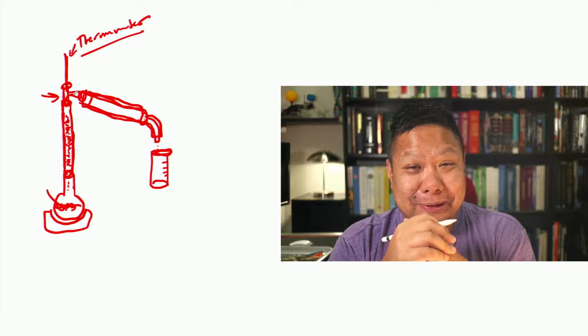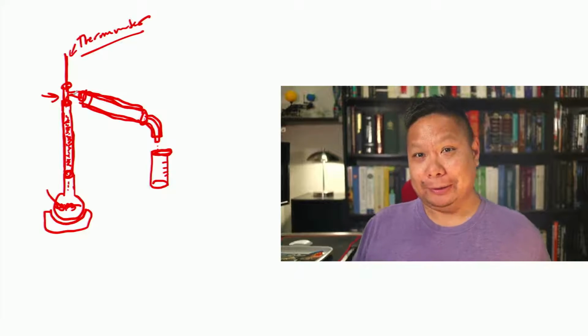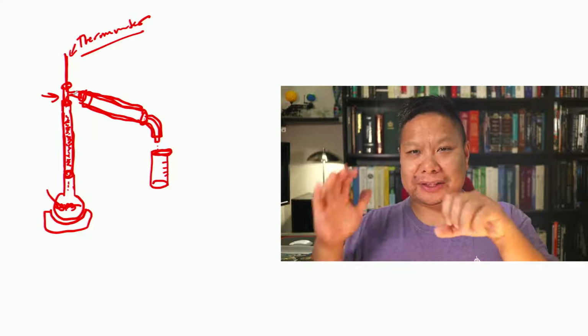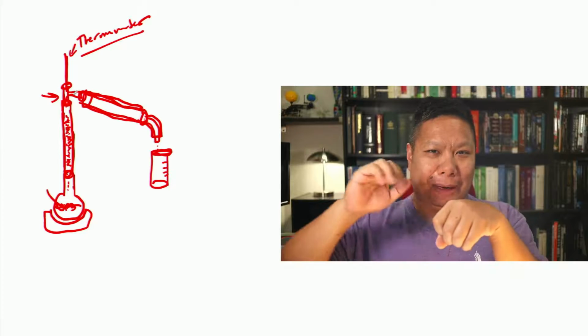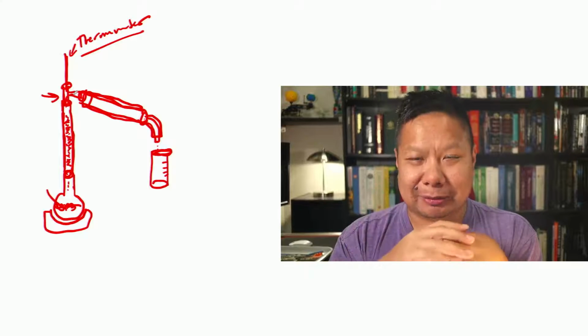I don't know what he was doing, but he wasn't really using a thermometer adapter. He was using a rubber stopper with a hole in it, which we have too, but they're not for thermometers, right? And he was forcing the thermometer down into the rubber stopper, trying to get it through the hole, thinking that was the thermometer adapter. Well, it wasn't, and it broke when he did it, right?